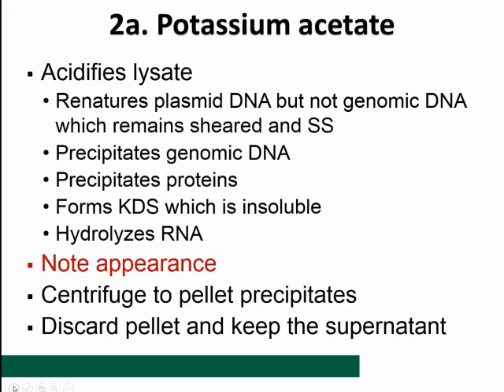And how about the genomic DNA? Well, it doesn't renature because the genomic DNA is very large and it takes a while for it to come back together. That's why in your isolation process, make sure that you do not shear the genomic DNA, because if you shear it into smaller fragments, those fragments will come together during the neutralization process.